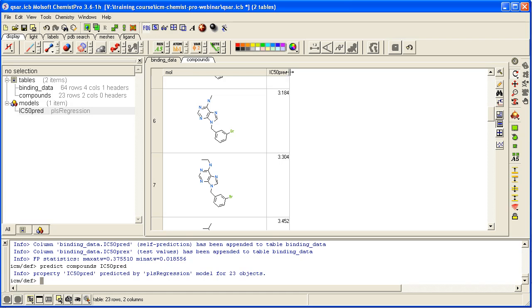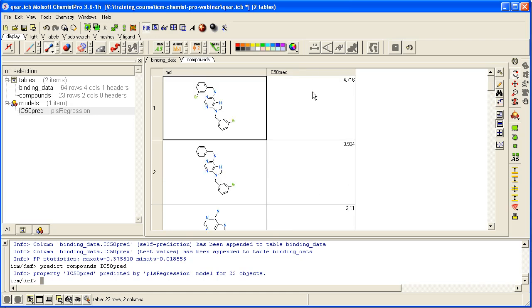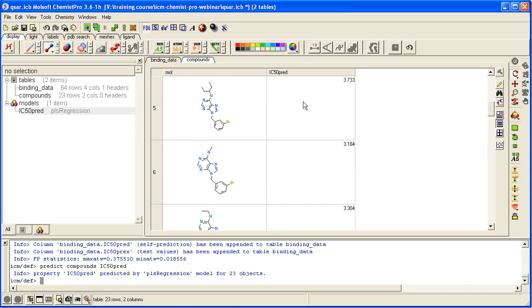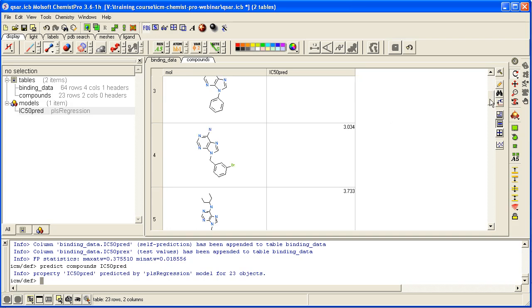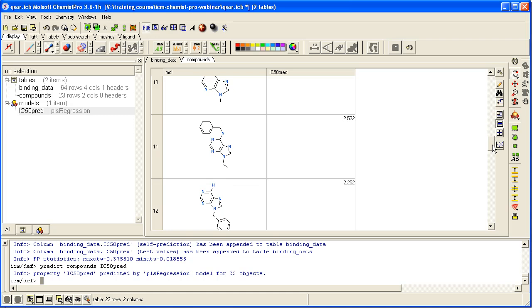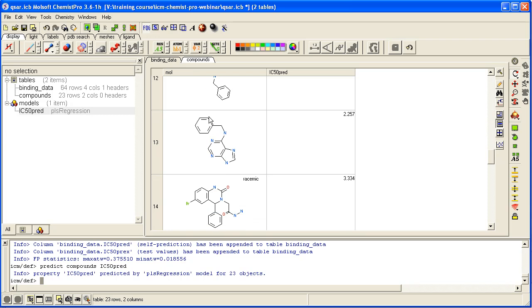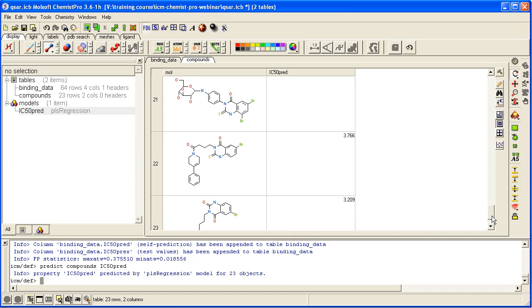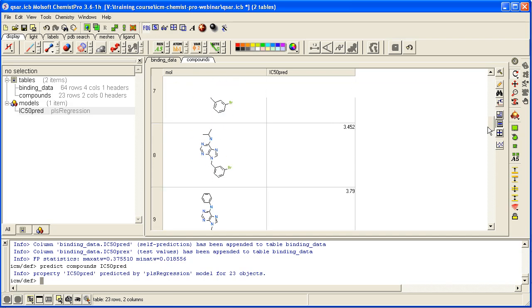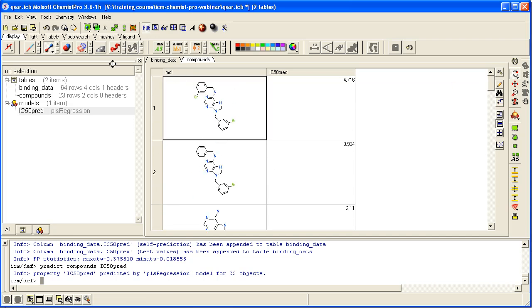And then you have a new column in your table called IC50 predicted. So this could be a good way of weeding out some compounds that aren't worth testing based on your model, or designing some new compounds based on your QSAR model.